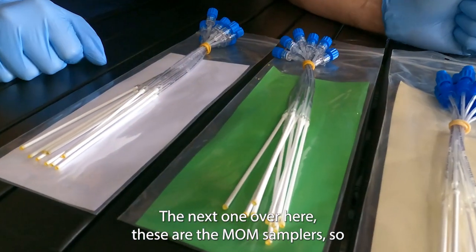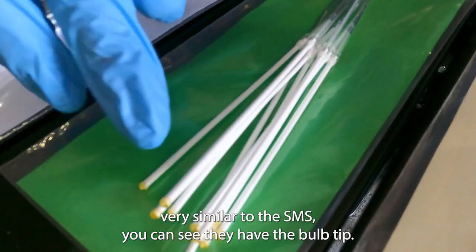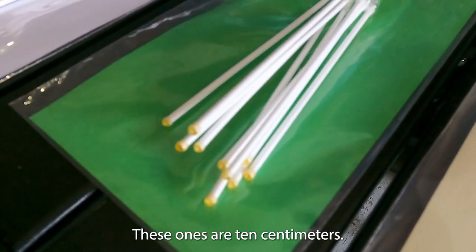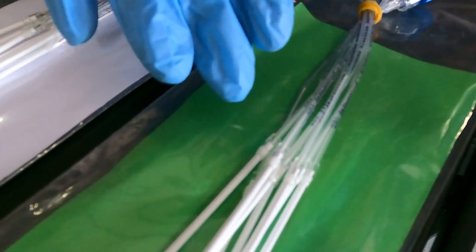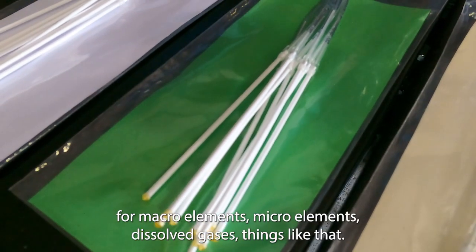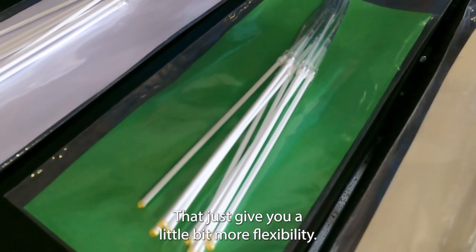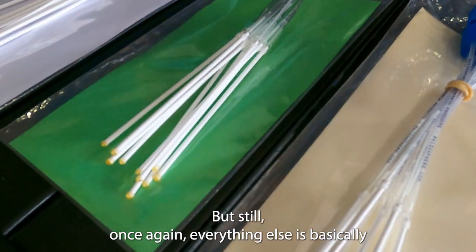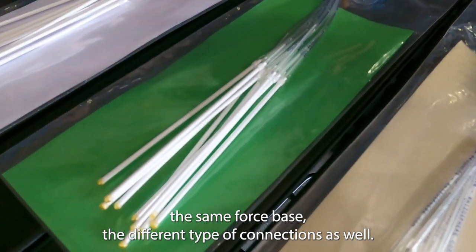The next ones are the MOM samplers, very similar to the SMS. You can see they have the bulb tip and these are 10 centimeters, but the reinforcement in these is actually a glass wire — so there's no metal. That means you can use these for macro elements, micro elements, dissolved gases, and things like that, which gives you a little bit more flexibility. Everything else is basically the same: pore space, different types of connections.